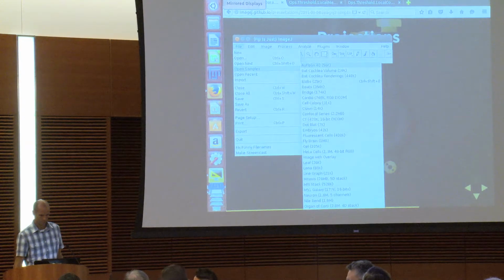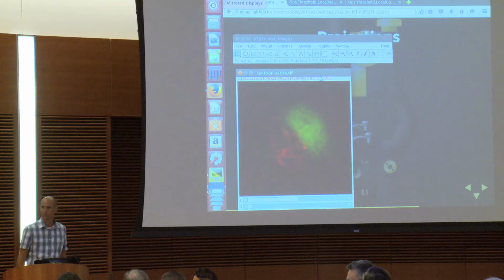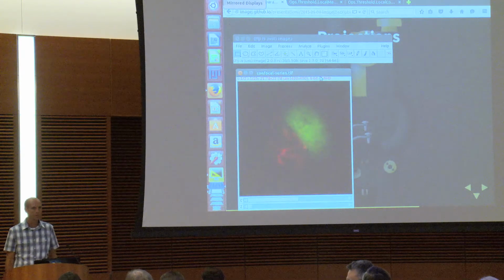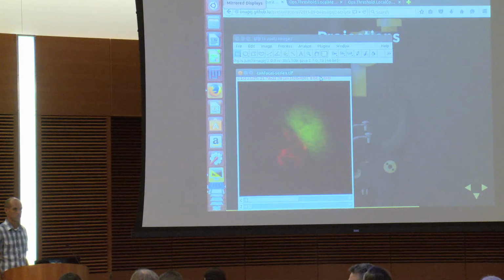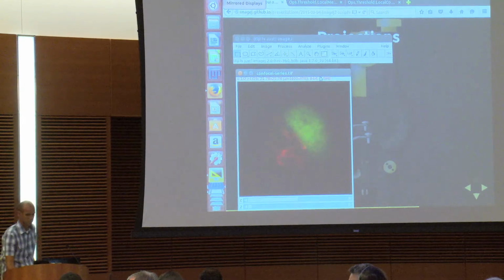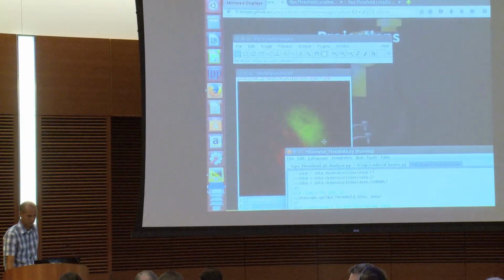Actually, you can also embed scripts in your macro, script snippets, but basically it boils down to writing a script then anyway. So I would advise using anything besides the macro language when you're trying to do things that are this complicated. Macros are nice for very fast prototyping with the recorder for simpler things. But if you find yourself with a 1,000-line macro, you should probably stop and ask, is this really the best way?